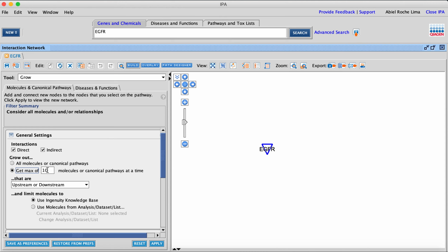Usually, you will end up with fewer proteins or genes than the ones that you gave as input. But those are the ones that are saying that this data is relevant. These are the proteins that you will need to pay attention to.